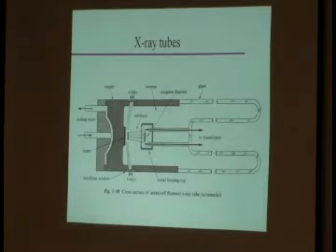So, let's start to look back at the first source. We've already looked at the X-ray cathode a little bit. Here's a little reminder. Here's your X-ray tube. You have a filament, you run electrons through it, you have a high voltage that accelerates the electrons towards your metal target, where they knock out core electrons. And that is how you then produce X-rays.